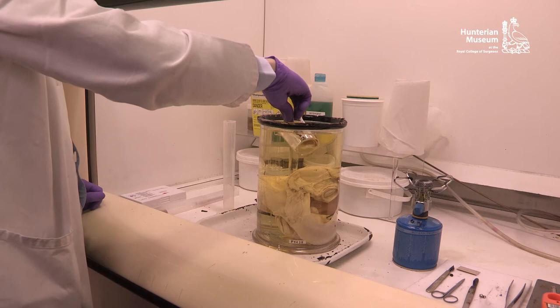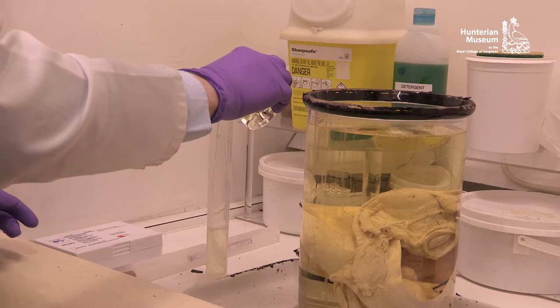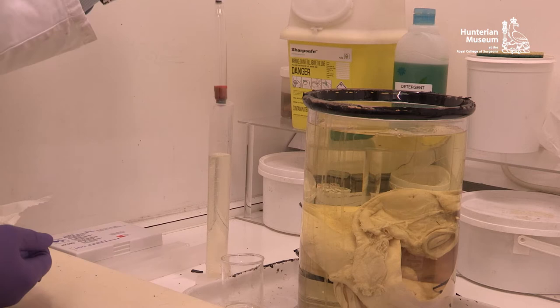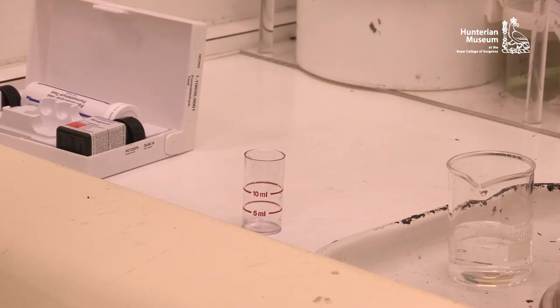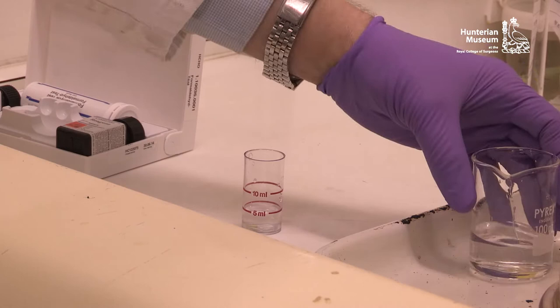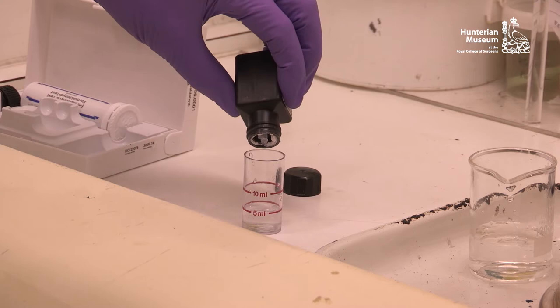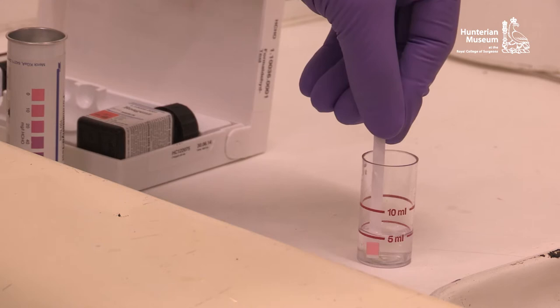Due to the possibility of toxic substances being present, fume extraction should be used when identifying an unknown fluid. It is important to determine what the preservative is, so the specimen can be placed into a similar or identical fluid without coming to any harm. A simple alcohol meter is an ideal instrument to use, as it not only determines the presence of alcohol but also provides a very accurate reading of the concentration. Formaldehyde test kits are available and provide a very accurate colour change in the presence of formaldehyde.